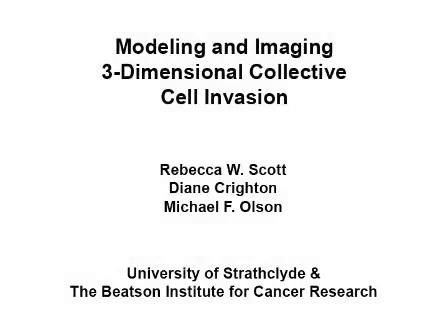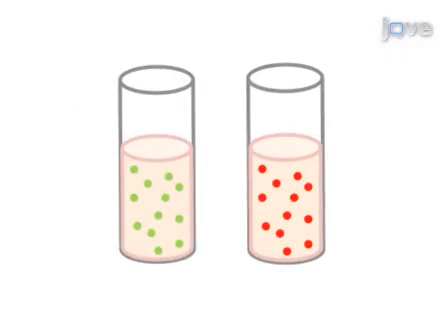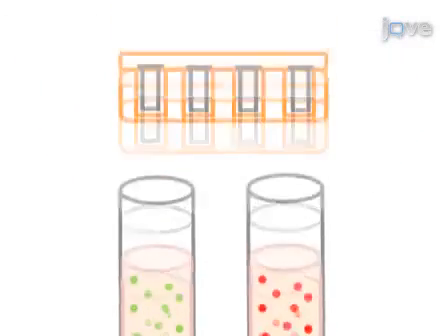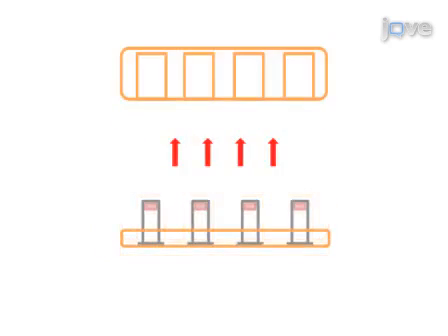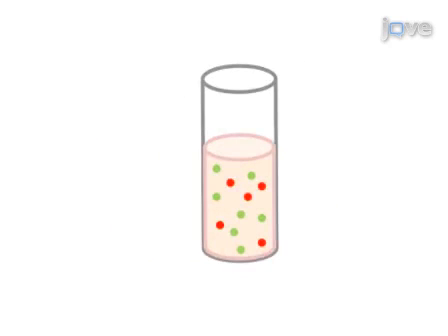This experimental system aims to characterize the contribution of specific proteins to the invasive process. Begin with retroviral transduction of cells with the fluorescent protein of interest. Also, create the 3D matrix of matrigel protein in transwell inserts. And prepare a cell suspension at the appropriate dilution.